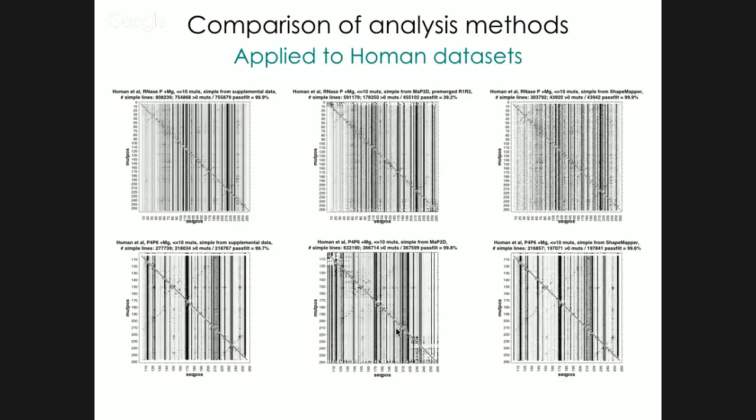It should be easy to fix that because there are these big artifactual hits coming out of the map2D pipeline that aren't present together. So you can just go look at those specific lines in the fastq file and see where they passed your filters but not the shape mapper filters, because both of these have fewer reads included. Now you have a guide, a signal to follow. So that's very exciting.